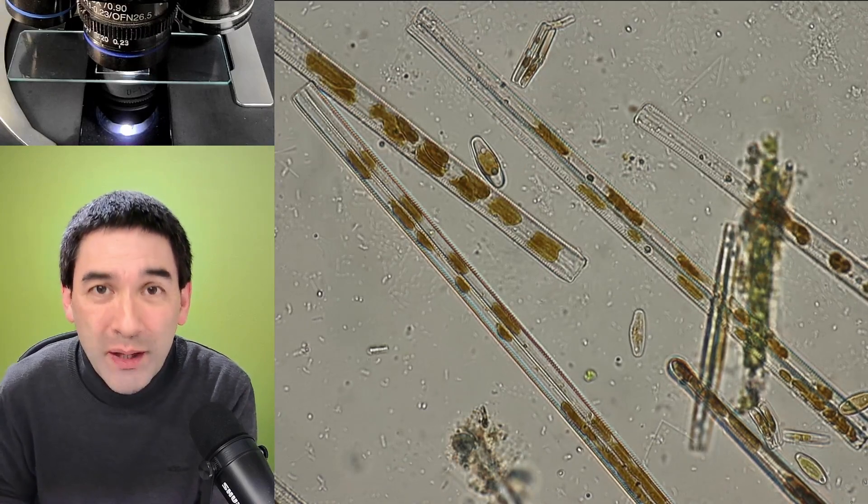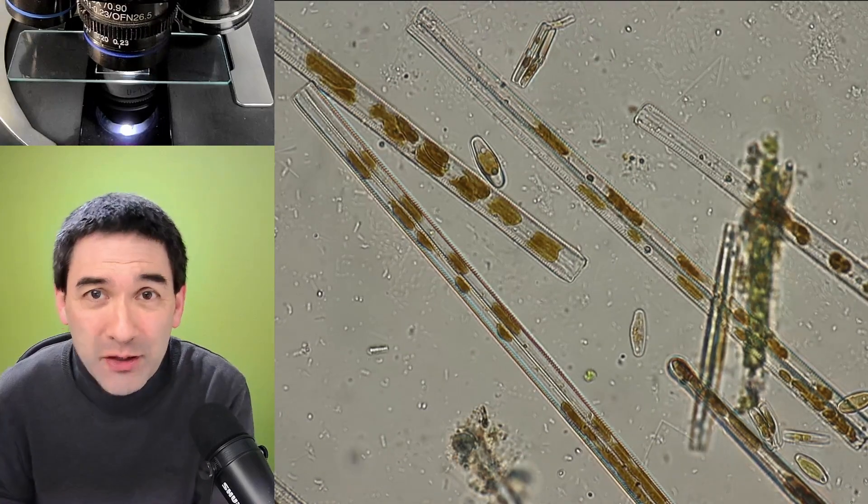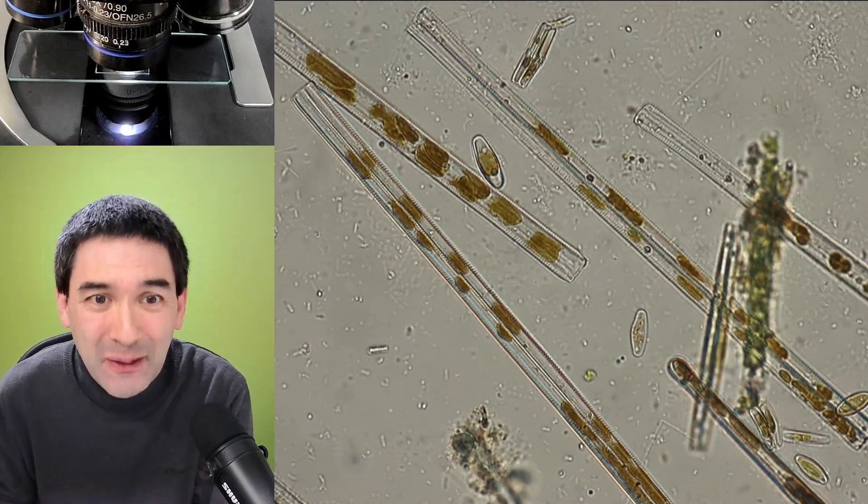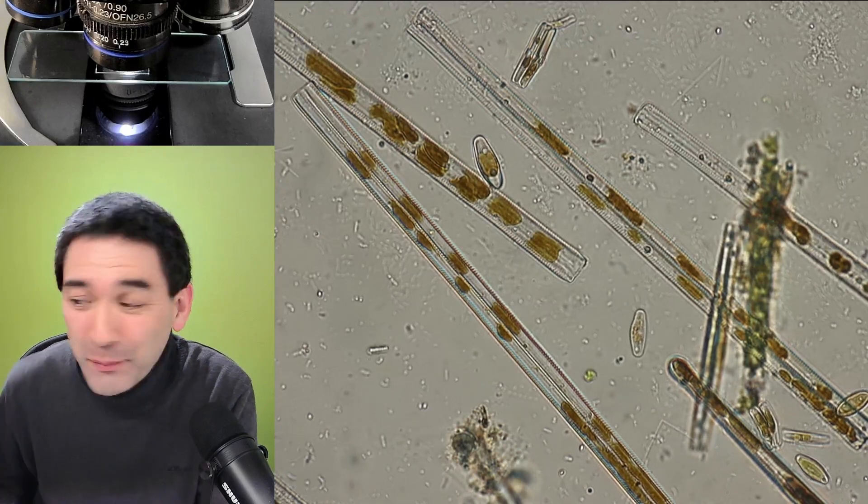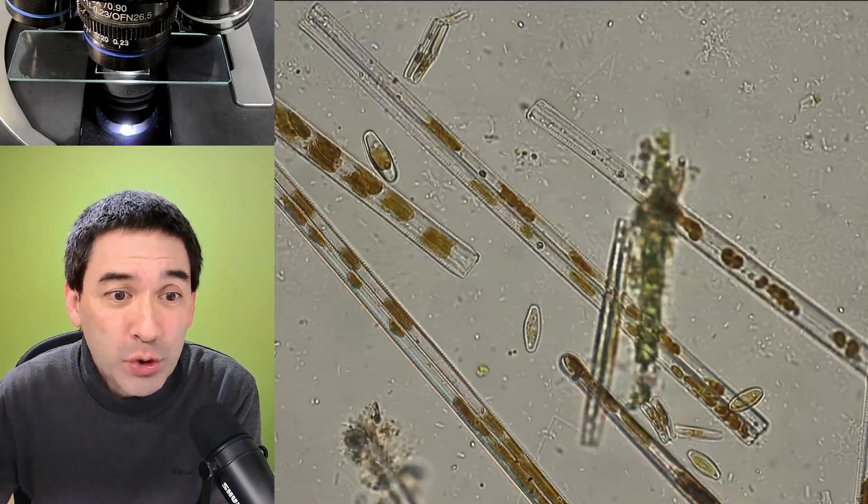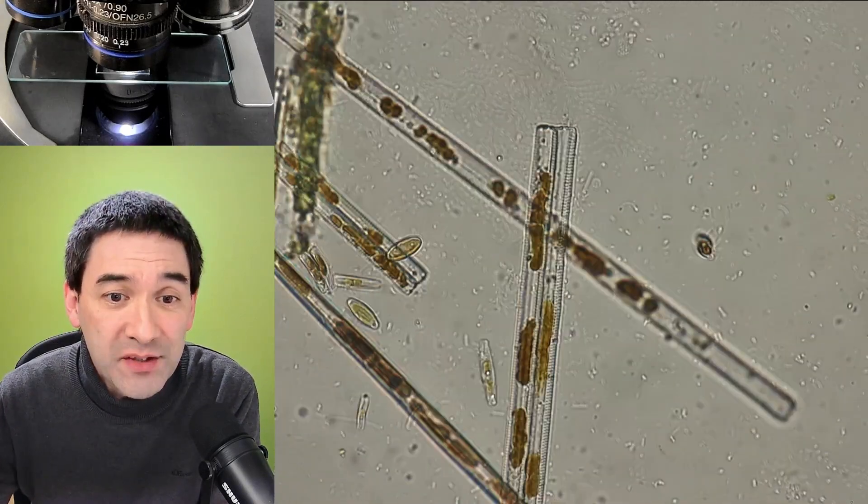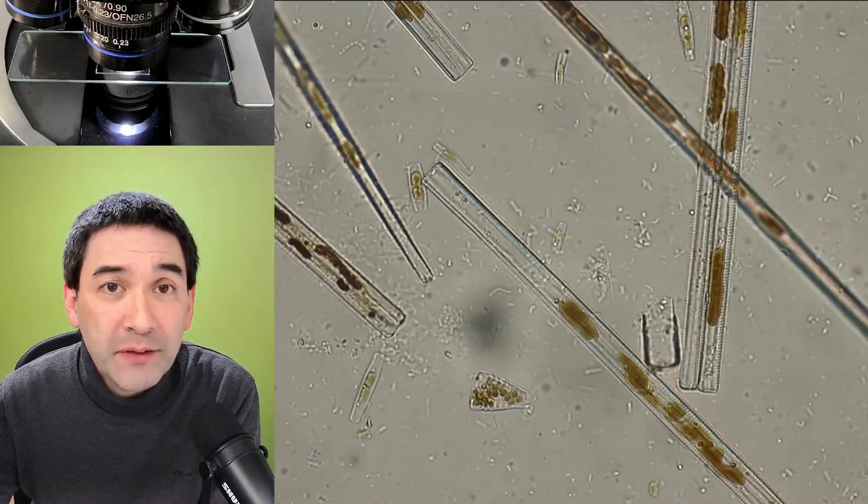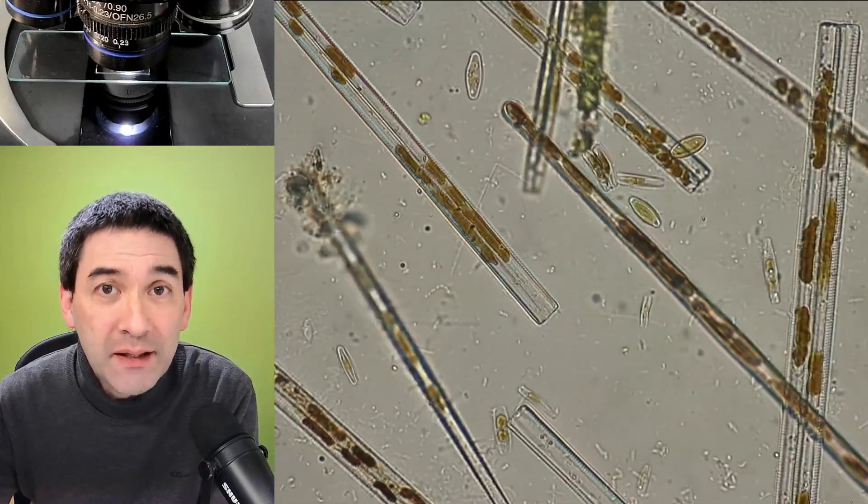What we see here is a wet mount, the original specimen showing diatoms. It's a water sample, and you can see in the background quite a bit of movement going on as well. I'm showing this to you as a reference.